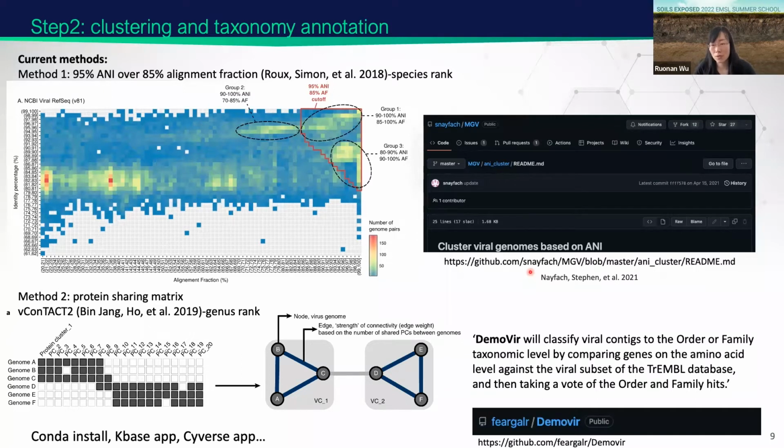And alternatively, you can use other tools or scripts that you feel more comfortable with, as long as you can calculate the average nucleotide identity, alignment fraction, and apply clustering algorithms. As long as you understand the fundamental methodology and a consensus is reached on the selected cutoffs, then the detailed steps can be relatively flexible.